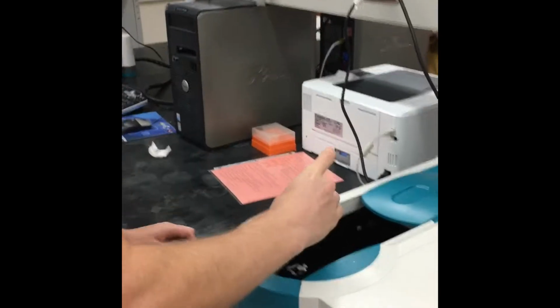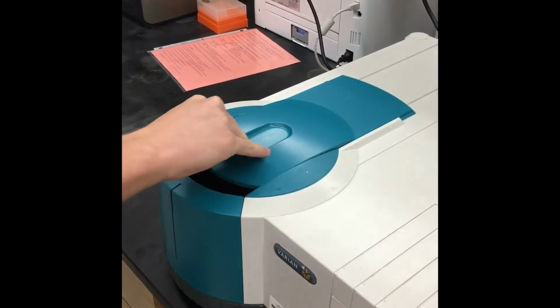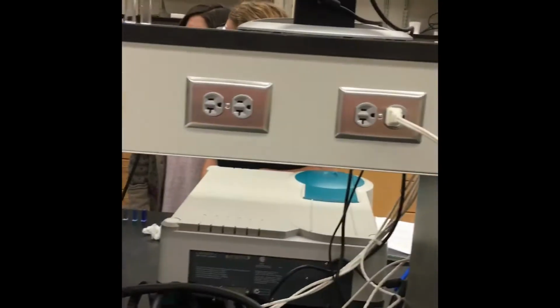So right here, Justin is adding the blank cuvette into the spectrophotometer to make sure that we have it zeroed. And then we are clicking 0 to make sure that the machine knows where it needs to be.